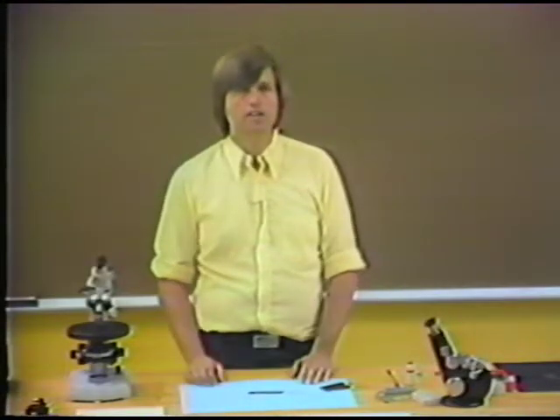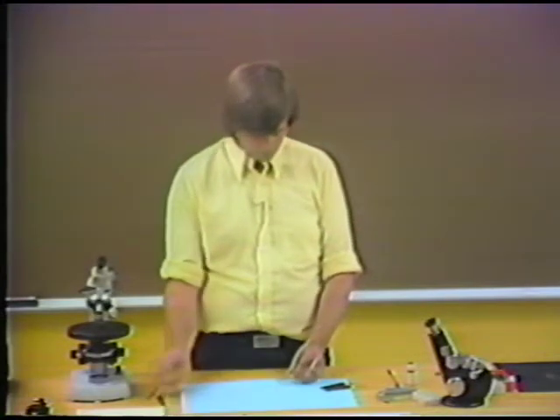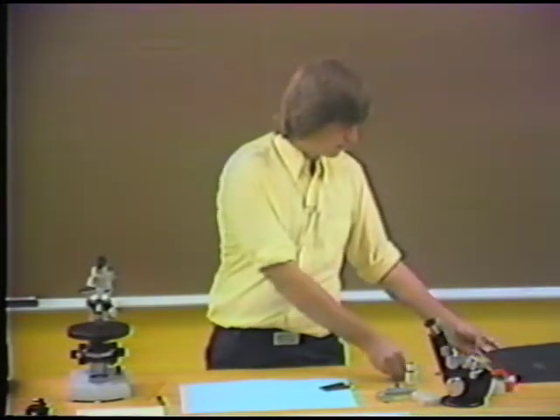Well, what are some different kinds of preparations that we look at on the microscope stage? Let's look at a few of these. The most common type is something we call a thin section. And I have a thin section here.